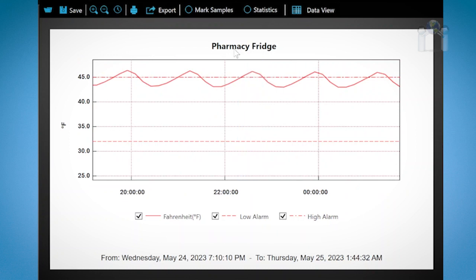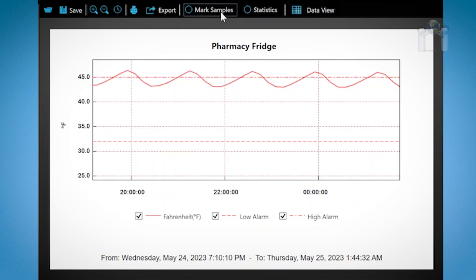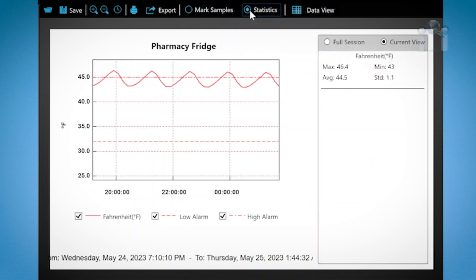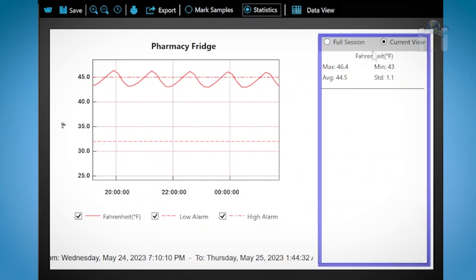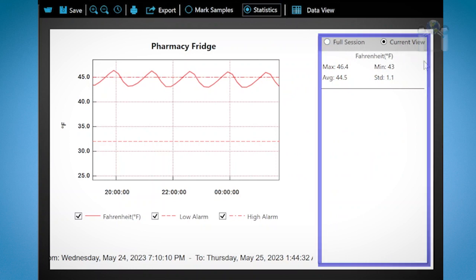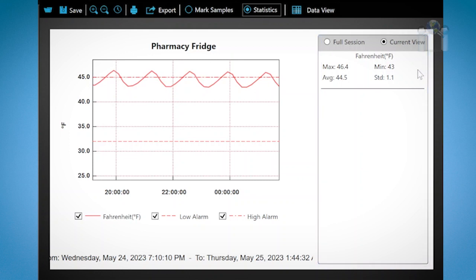Click on mark samples and you'll see dots appear on the solid line. Each dot represents the moment the data logger recorded a reading. If you click the option again the dots will be removed. Click on statistics and the window will appear on the right. The current view will show you the details of the selected area of the graph. Full sessions will show the statistics from when you start and stop the data logger.